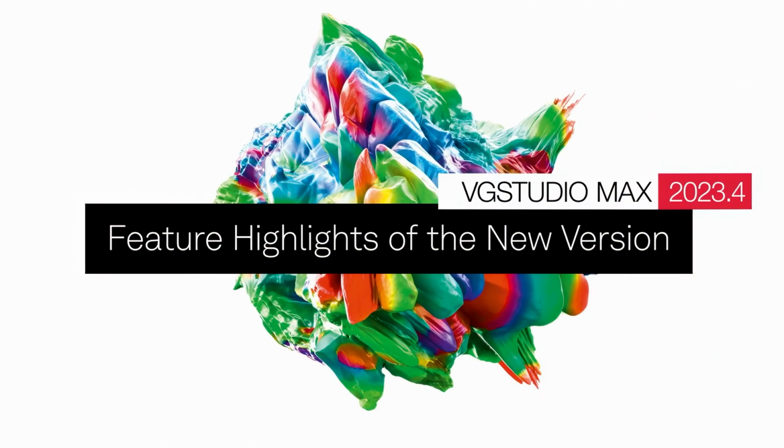All right, then join me on a little tour through the feature highlights of our brand new 2023.4. Let's go.